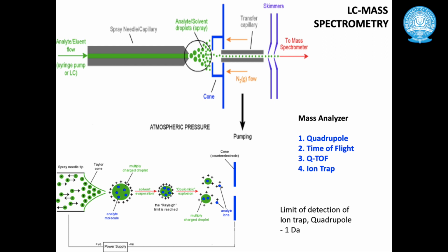So not only from this precursor ion which is shown here with its [M+H]+ mass, we will also be able to confirm this by the product ion obtained from this precursor ion. The product ion here is 287 m/z.